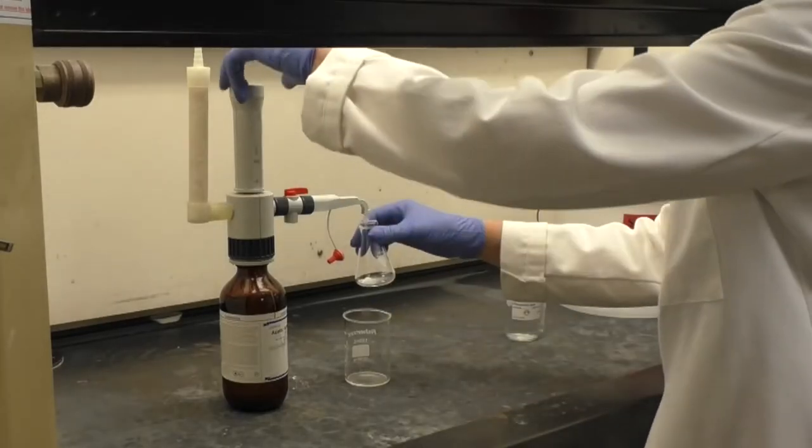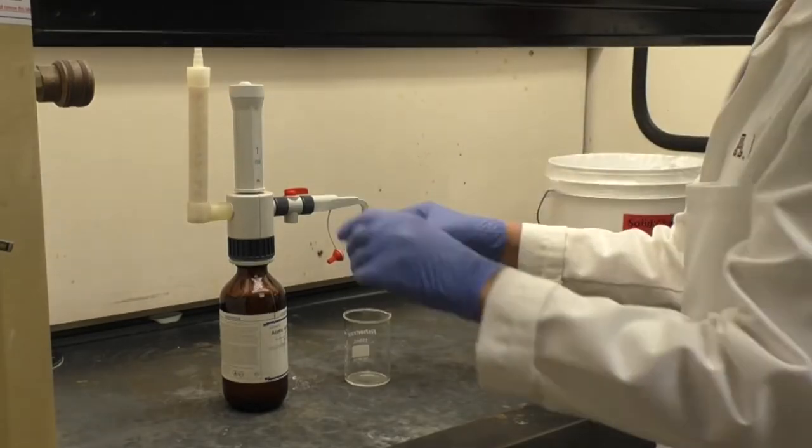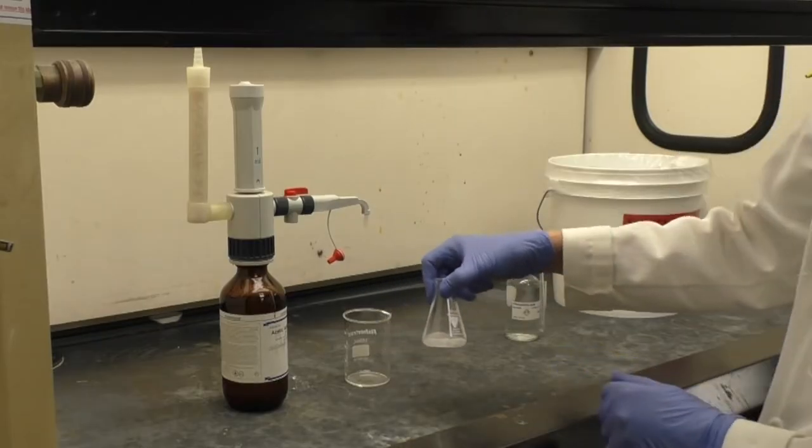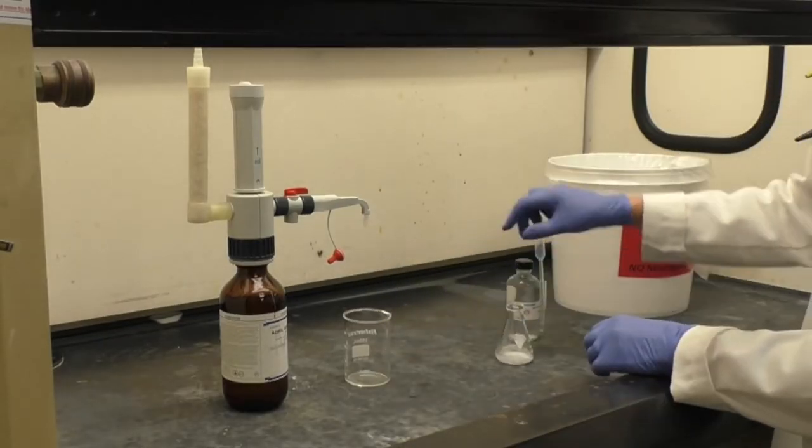Next, using the 1 milliliter pump provided, add 1 milliliter of acetic anhydride to the flask. Swirl well to mix.